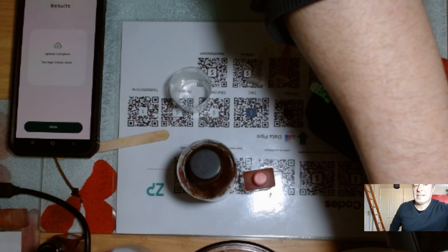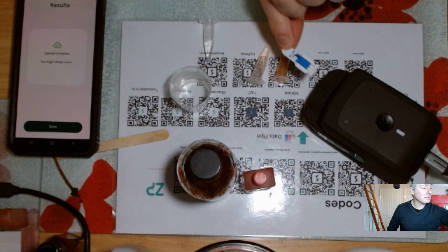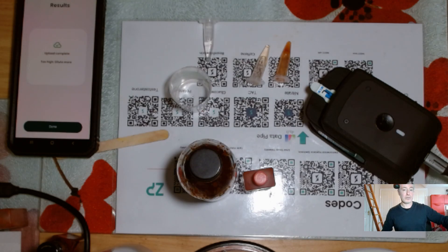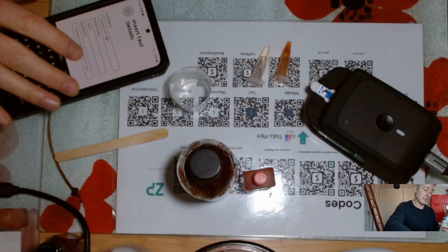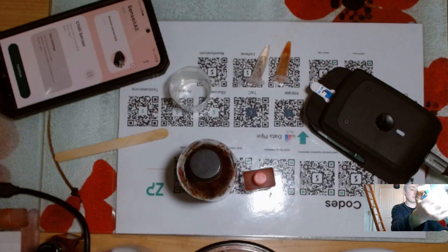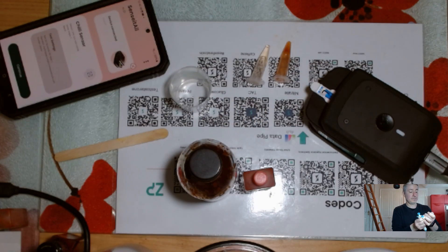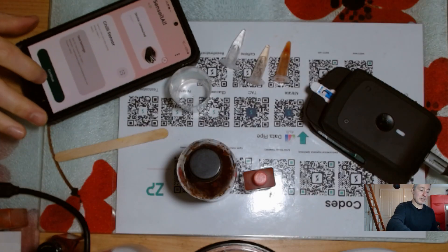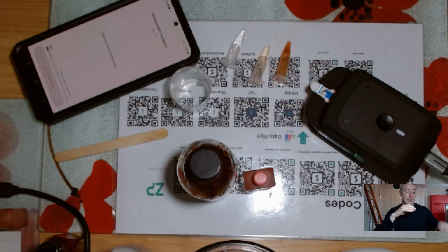Vortexing becomes less important the more dilution you do, because the sample becomes very homogeneous at this point. I'm going to take 50 microliters out of my one-in-1000 with a clean pipette tip. Before I do that, I'll update the app to say 'one-in-1000' so I can identify that data later. The 50 microliters goes onto the sensor. I'll go continue, select one-in-1000, and start.